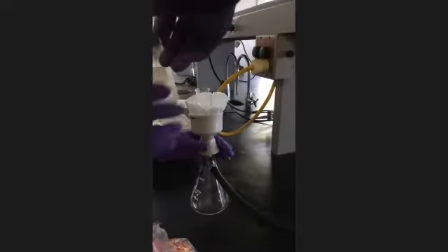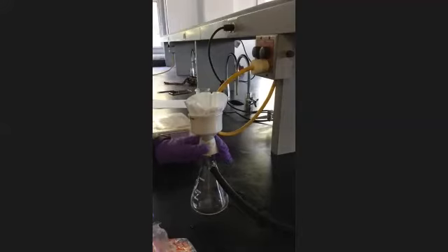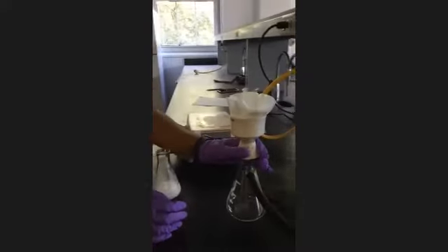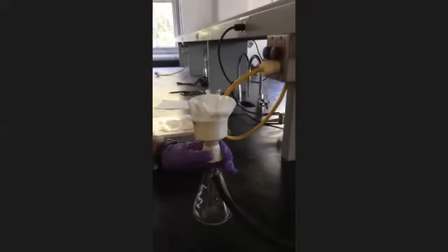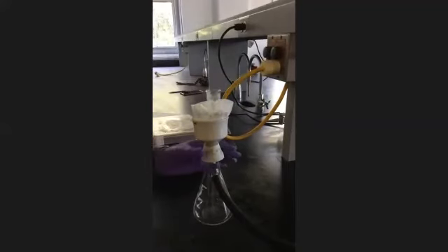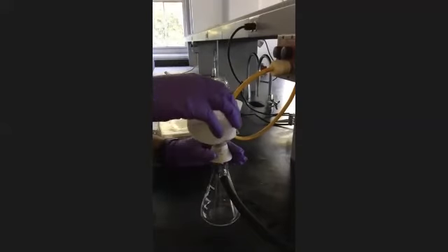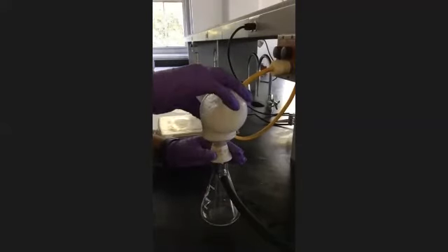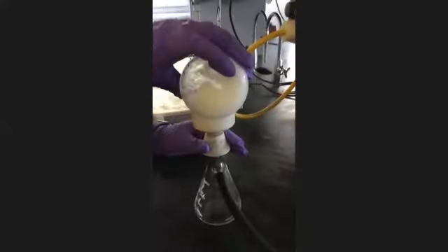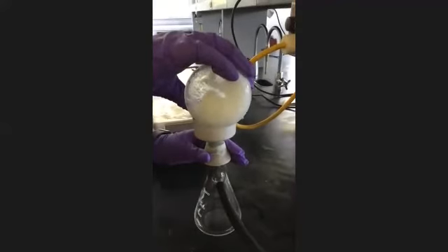There you go. So when you filter it, you're gonna turn on the water supply, and while that water is going, you're just gonna pour that on. Don't you have to rinse it twice? 15 or 10 mils? 20 mils twice. All right, so go ahead and pour it. Just don't dump it, but just pour it on. And you'll see in the flask, you're gonna see the water start to come through to the bottom, because you're pulling back on it.